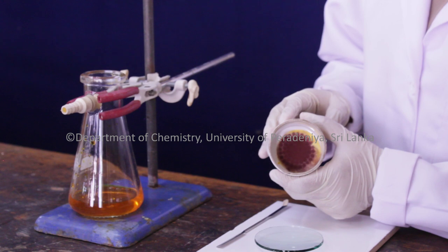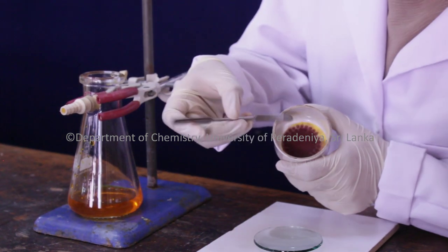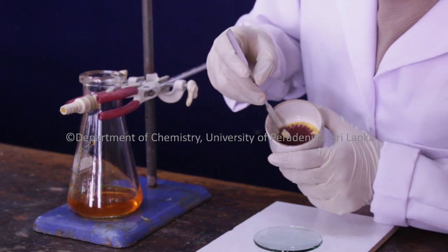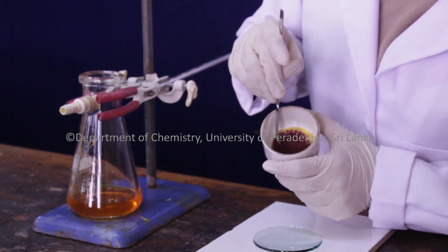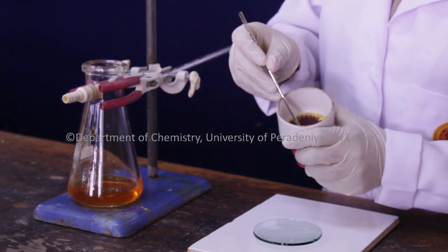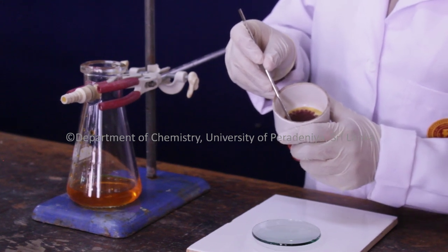You can remove the dried solid from the filter paper by scraping like this. If further drying is needed, the solid product can be transferred to a desiccator.